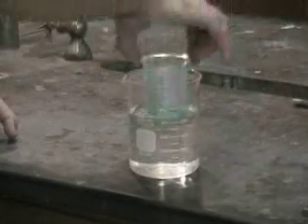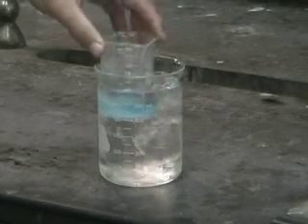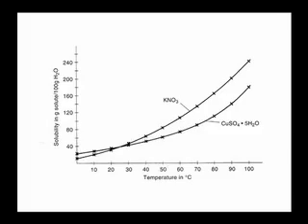In a process called fractional crystallization, we cool the mixture so the potassium nitrate will begin to solidify, remembering that the solubility of potassium nitrate drops much faster than copper sulfate as the solution cools. Notice from the curve that if the solution is saturated at 100 degrees with potassium nitrate, when we cool it to 0, a lot will fall out of solution. We have designed the experiment so the solution is saturated with potassium nitrate, but not copper sulfate. Notice, however, some copper sulfate might also fall out of solution and contribute to the impurity of our sample.